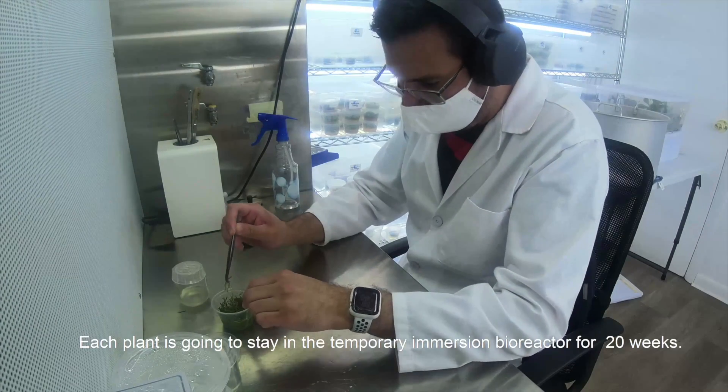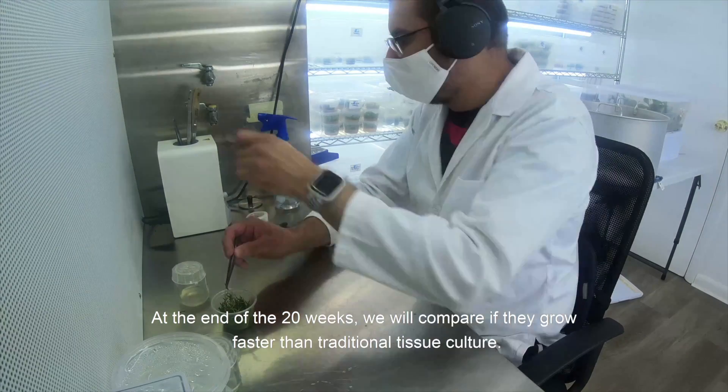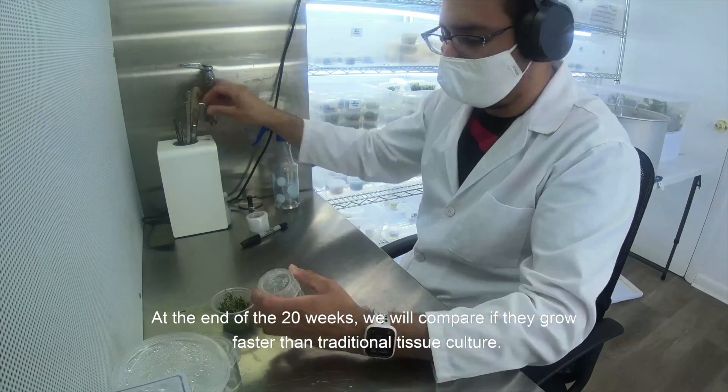Each plant is going to stay in the temporary immersion bioreactor for 20 weeks, and at the end of the 20 weeks we will compare if they grow faster than traditional tissue culture.